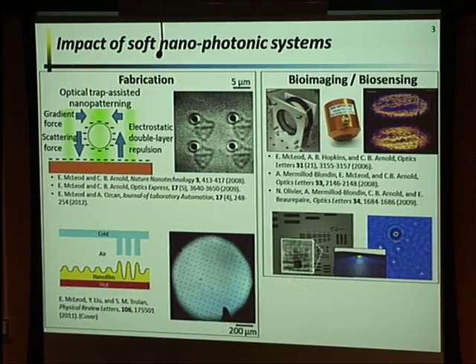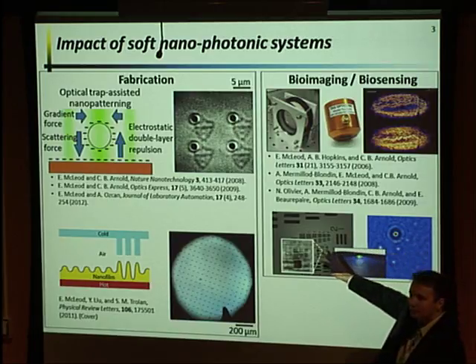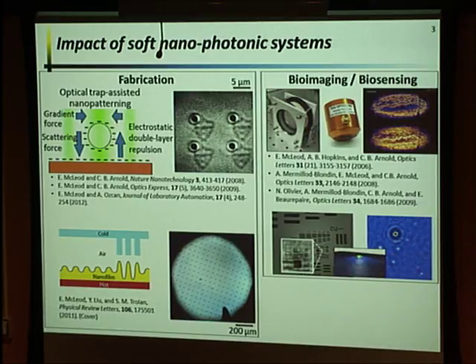Most of what I'm going to talk about today is being able to improve the sensitivity so that we can detect very small particles. In this case, we're going to be detecting nanoscale particles, but across a field of view that's millimeters by millimeters. So there's a very large difference in scale between what we're sensing and the number of particles or the area with which we can sense them.